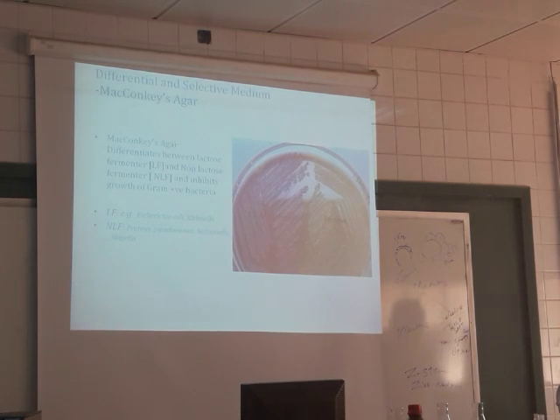Okay, remember, MacConkey agar has a property: it is differential as well as selective. It differentiates between lactose fermenters and non-lactose fermenters. And it is selective: it inhibits gram-positive bacteria, because in MacConkey agar there is the presence of bile salts, and bile salts do not allow the gram-positives to grow. This makes it a selective media because of bile salts.